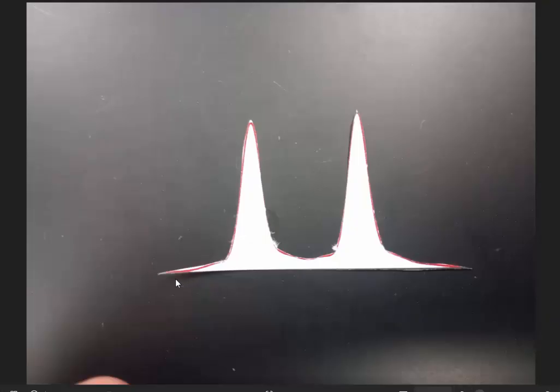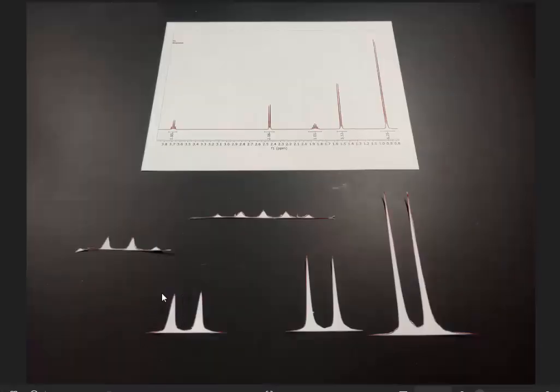By contrast, with the doublet, there is no such requirement to have excess paper on the peak, and therefore it is easier to compare all three doublets to each other. The amount of deviation from the baseline is more consistent with the doublet peaks relative to each other. And this is an important finding. When I'm doing the integration by paper, I can clearly have the doublets integrate on a consistent scale relative to each other, and that's actually a finding that translates into the computer as well.